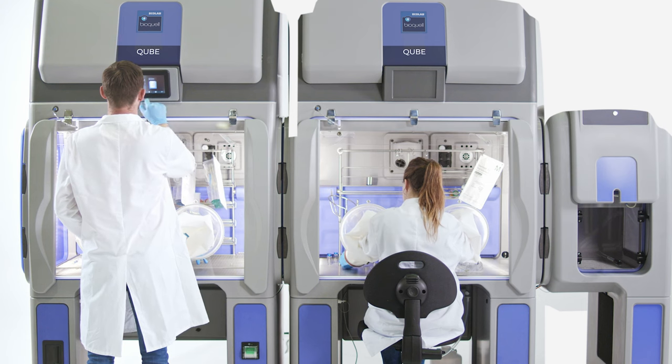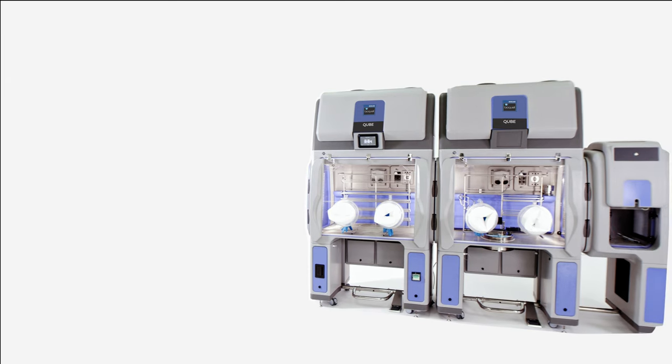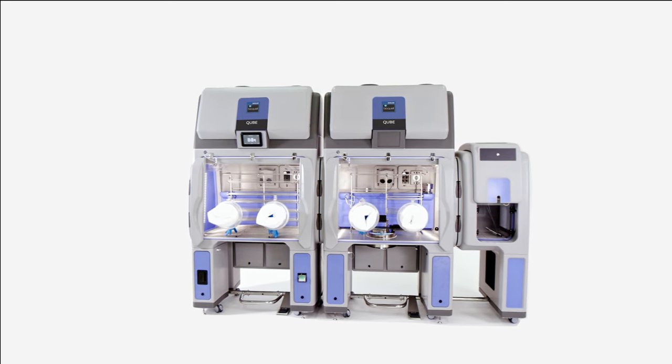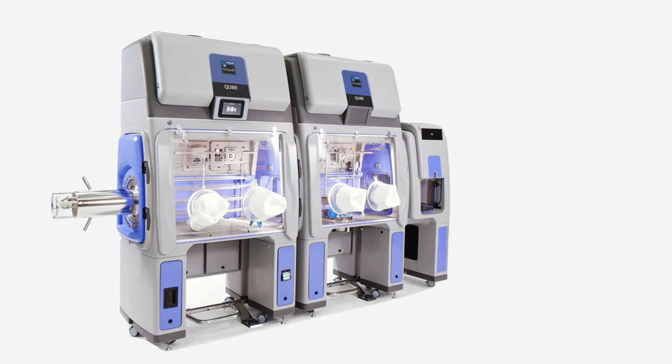Globally accepted. With hundreds of chambers currently installed and in use with world leaders in biopharmaceutical laboratory research and biotechnology, the BioQuell Cube delivers efficiency, reliability, and ease of implementation to your aseptic environment.